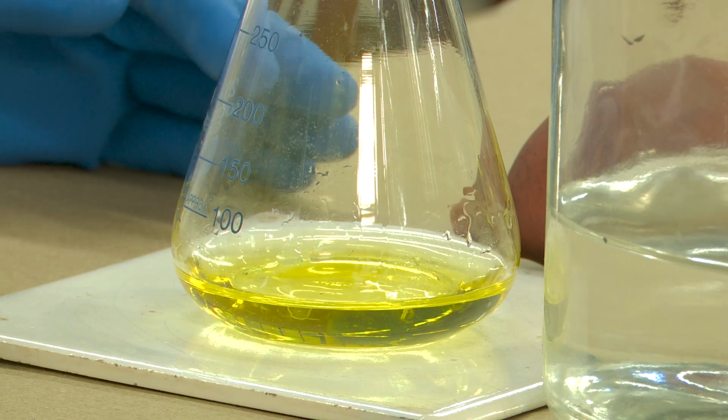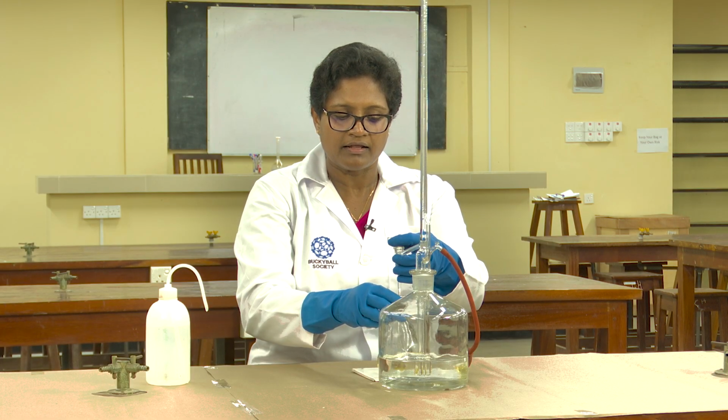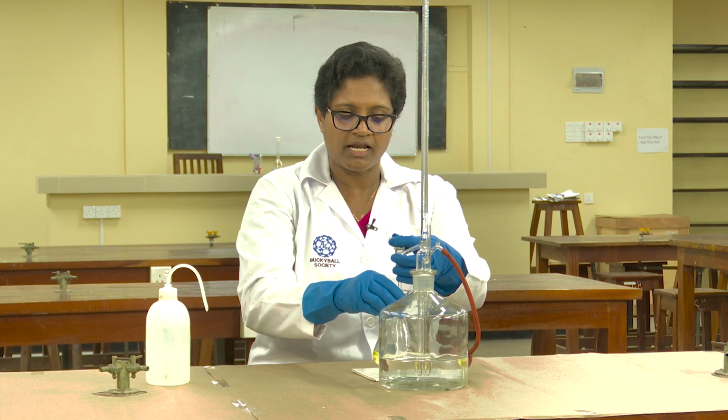Now let's begin the titration. Here you have to add the standard HCl solution dropwise into the titration flask until you observe the color change from yellow to pink.